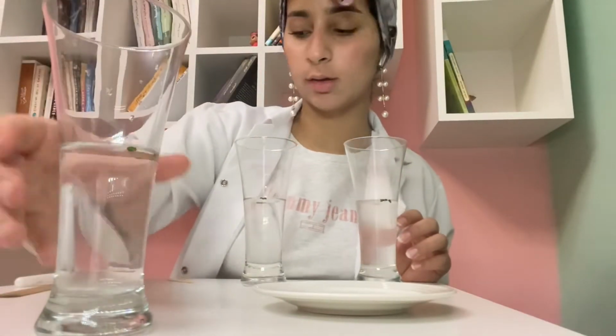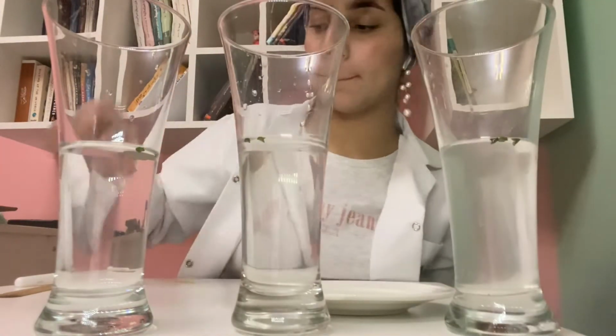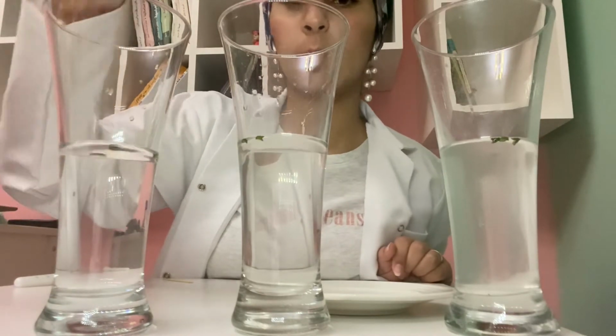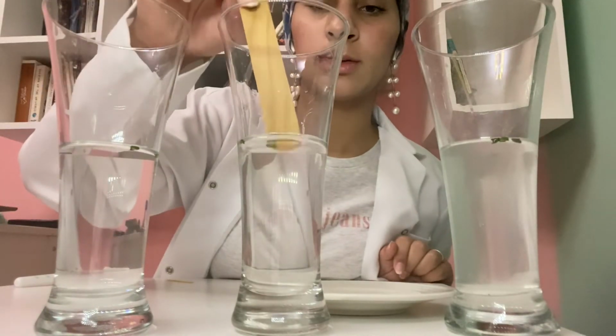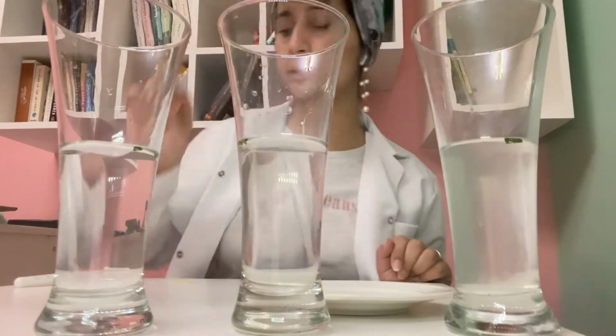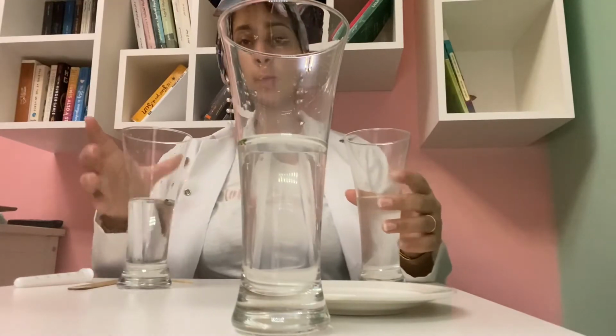Now, as we see, those discs are floating in all of the different concentrations, here, and here, and here. This is because of the air sacs that the discs have. The discs have air sacs that are filled with gases. Those gases make the discs less dense, which makes them float. So we need to make them sink.